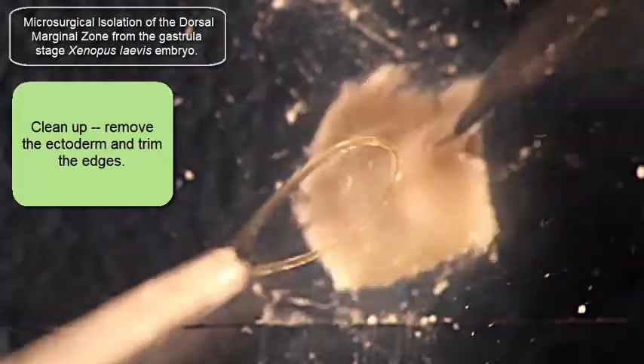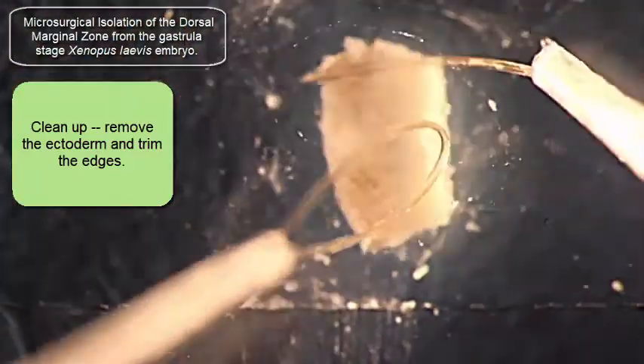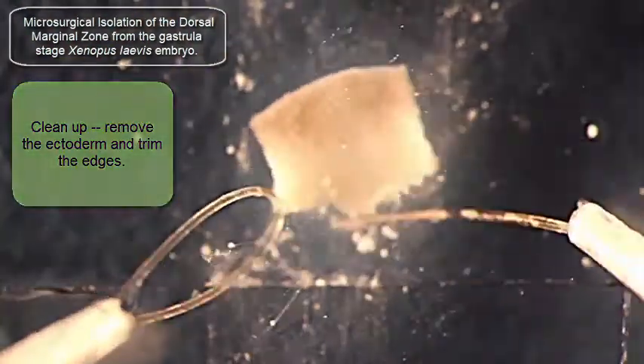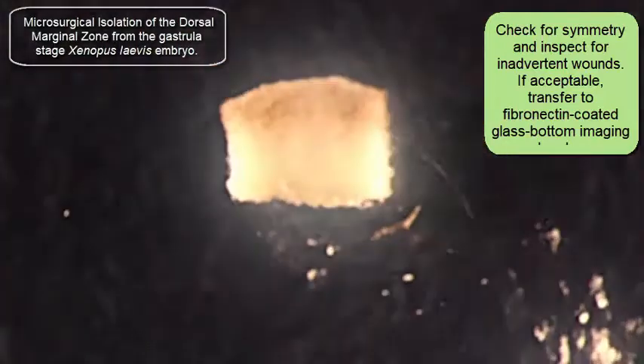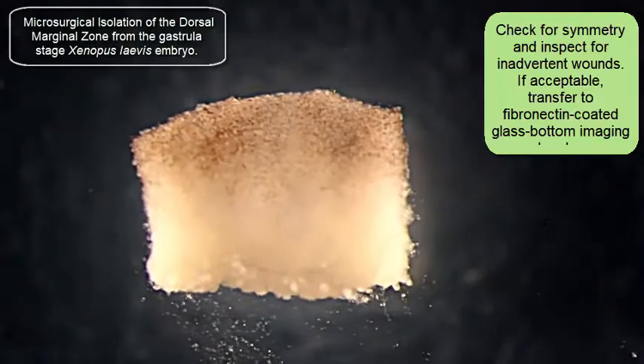At this point I'm going to be trimming up the explant, tidying it up, removing that animal cap portion, cleaning it up a little bit. And then finally I want to move it to a clean part of the dish and inspect it to make sure that the explant is symmetrical and there aren't any wounds on the surface — and there aren't.